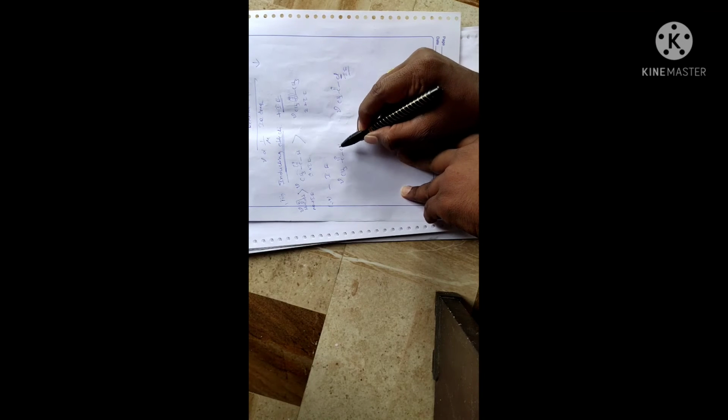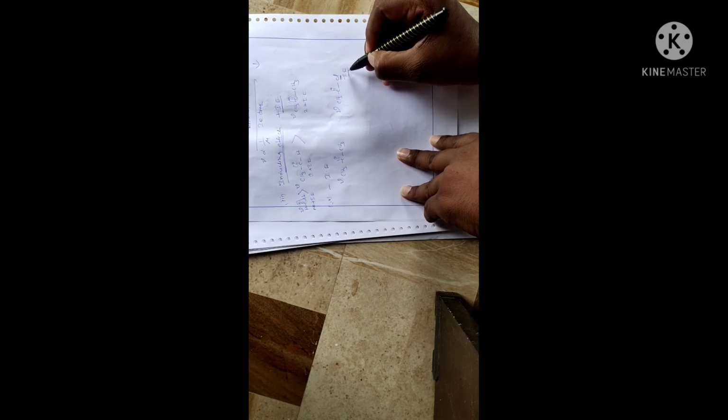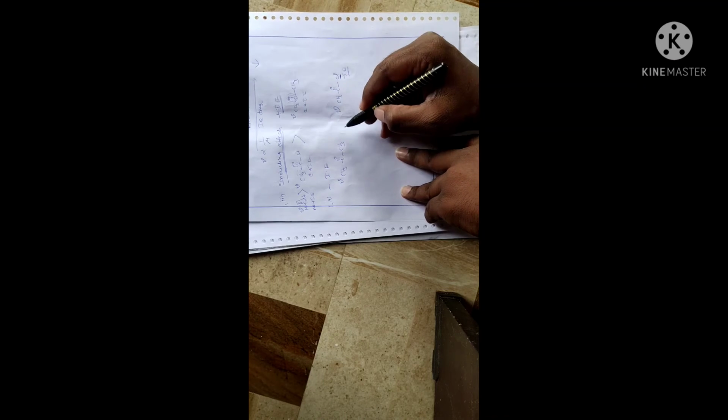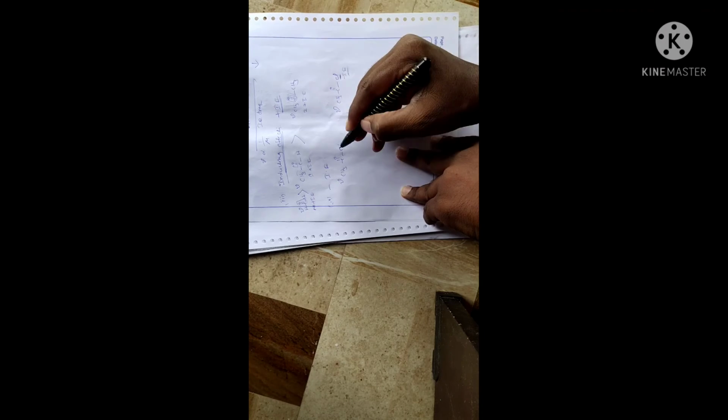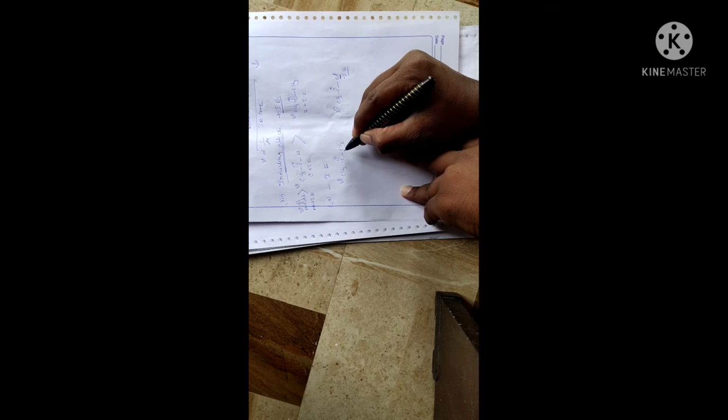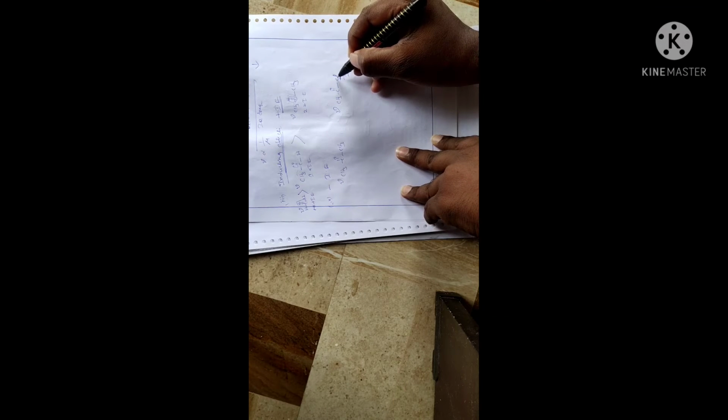Due to the donating groups, the CO character is lost, but here, with the withdrawing minus I group, the CO character is retained.